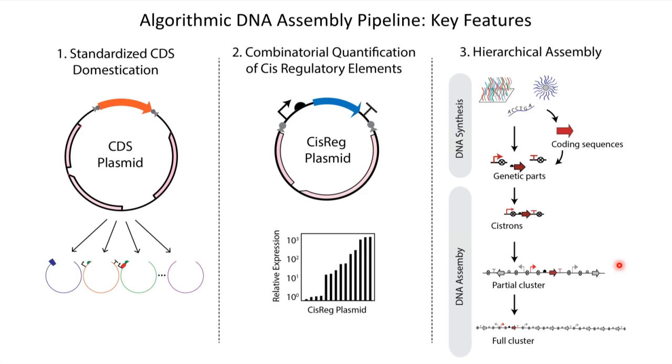There are DNA assembly methods that will allow you to take upwards of 20 or 25 parts at once and do one large assembly reaction to jump all the way, for example, from 25 individual cistrons to a 25 gene full construct. However, those ambitious multi-part assembly reactions usually come at the cost of efficiency. Instead, we favor going through intermediate constructs where we're only bringing together 5 or 6 pieces of DNA at a time, isolating those intermediate plasmids, and then doing another 5 or 6 piece DNA assembly reaction in order to maintain reaction efficiencies on the order of 90 to 95%.